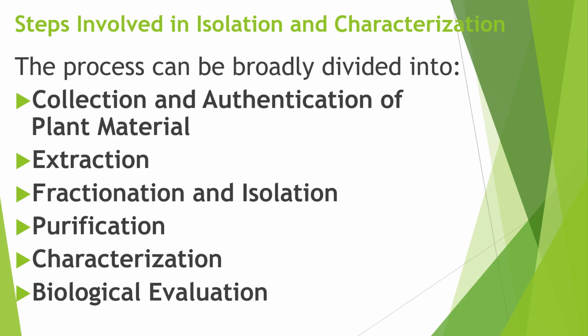Purification is considered as one of the important features as far as the entire process is concerned, because until and unless you are purifying the product properly, your product may be in such a position where it stands along with the different impurities. It affects a lot in case of animal studies, furthermore in case of phytochemical screening, or in case of different analytical processes. So purification is very much important.